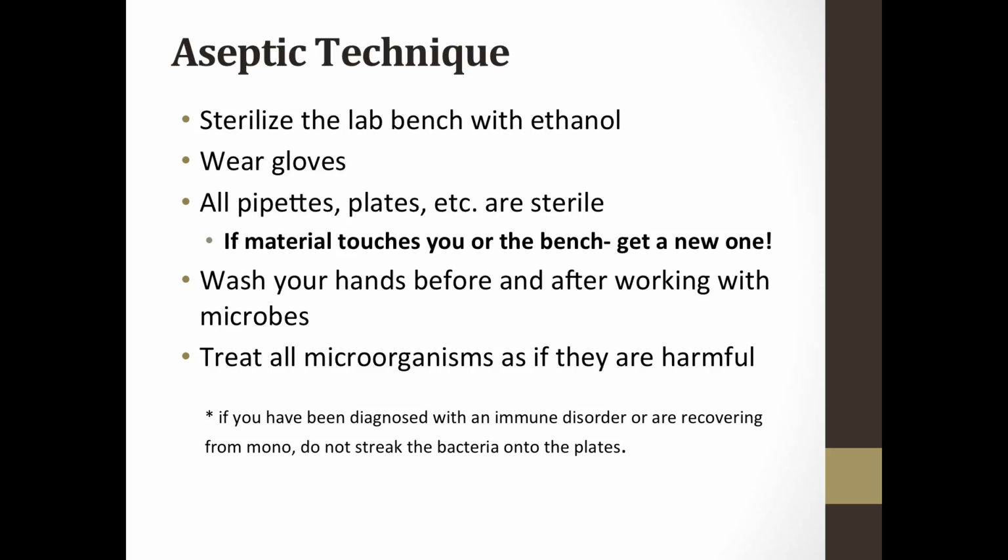Anything that you use for this lab and also for Lab 5, where we're concentrating on aseptic technique, needs to be sterile. So any of the pipettes you use or the tryptic soy agar plates, anything else that you use like that needs to be sterilized. If you set something down on the bench, it's no longer sterile, so you should get a new one. It's always good lab practice to wash your hands before and after you work with any microbes, and to treat any microorganisms as if they're harmful. Even if you know they're not harmful, if you still treat them like that and you get in the habit of it, that's good lab technique. And that's it.